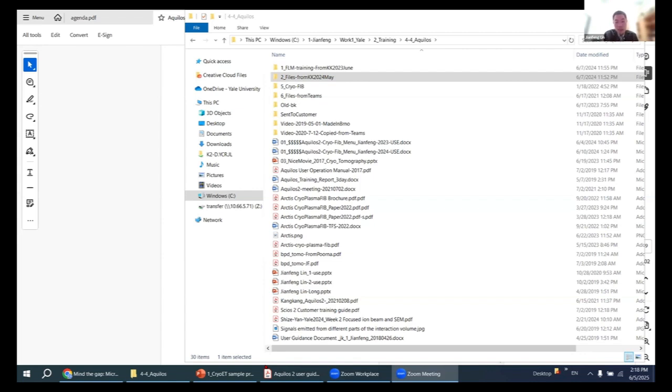And another thing is that generally the software will put the location in the home position, which is far away from the top piece of the ion beam. That is also better because that location is cleaner, because the location close to the ion beam may have more contamination. So it's not good for your sample.